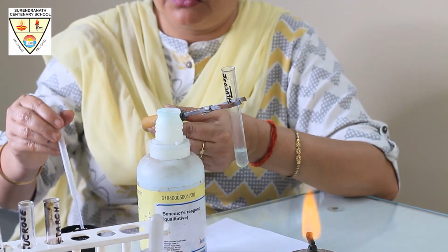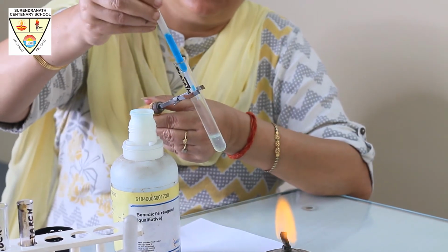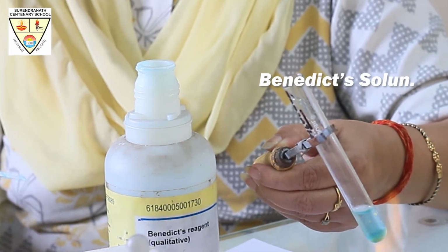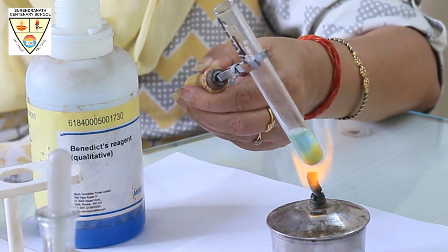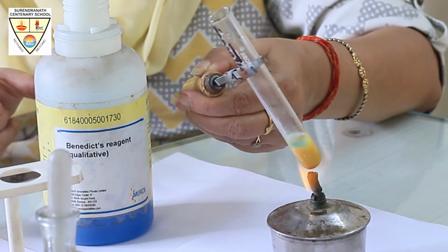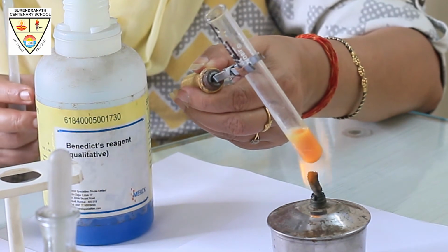You can also take a test tube, add 2 milliliter of this monosaccharide, Glucon D or fruit juice. To that, add 2 milliliter of Benedict solution, and again heat it slowly. Be very careful that the test tube does not break and it's not heated for quite a long time. You will slowly see the color changing to orangish yellow, which confirms the test for glucose and monosaccharide.